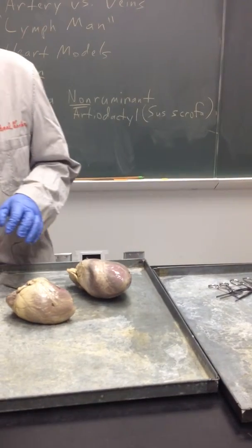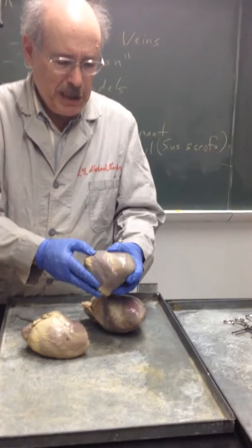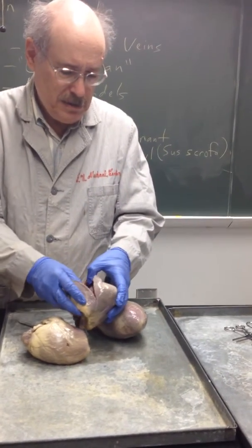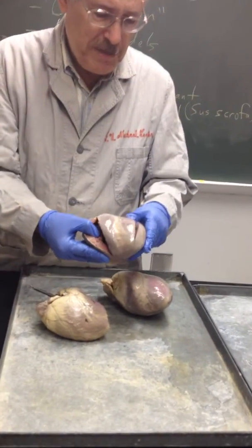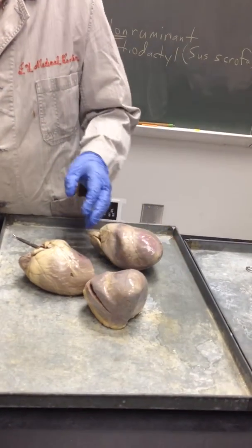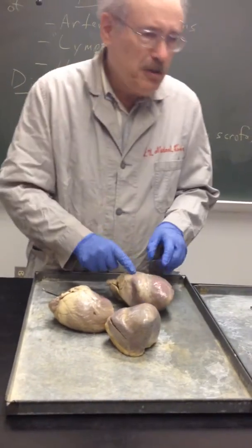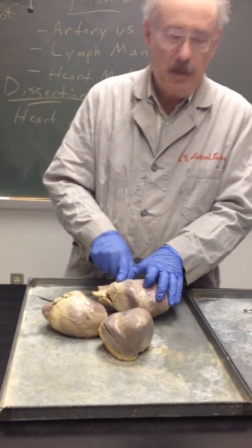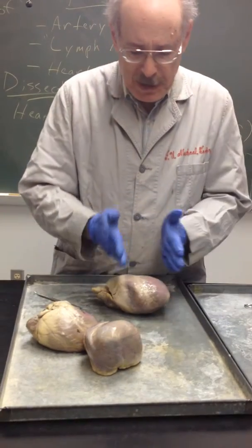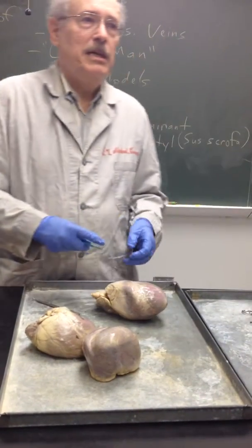All right, let me see if I have some pre-cuts. Yeah, this is a good pre-cut one we can reuse again. This will save you some time, so you don't have to cut it, you just look at it. I'm going to use those. And if you do the new ones, I'll save those as well. Or if you get one that's not yet cut, let me demonstrate how you do it.